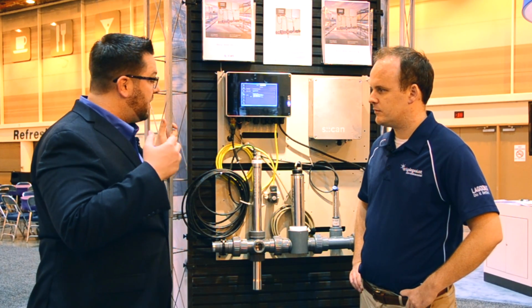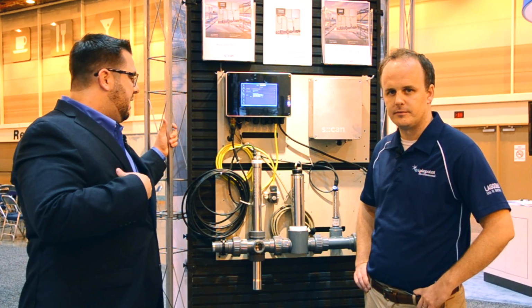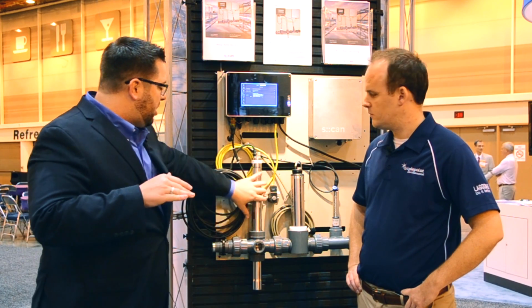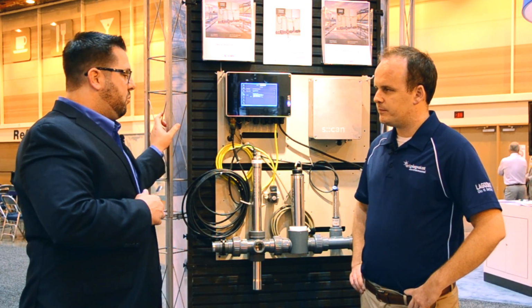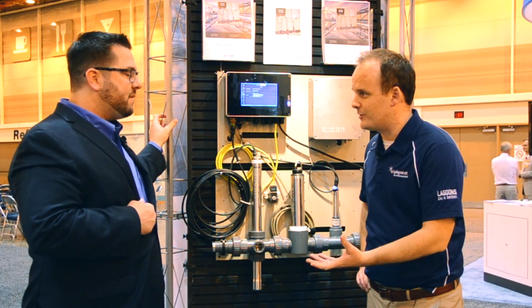Another thing that's really neat is ammonia-based aeration control. So we have some energy savings or cost reduction in running our blowers at an optimized speed. And then we're also getting away from the old technology with reagents. The spectrometer has been around since 1999, but it's only lately that we've seen it become mainstream and used in real-time installations. We're getting away from the reagents and chemical addition, and going towards something cost-effective, with a long-term service life, and a lot easier to use.